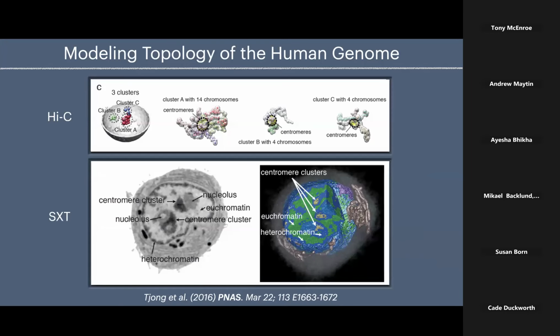with just using the LAC values. And this was a study by Frank L. He had collected all of the Hi-C data of a bunch of B cells that had been done by one study, and was modeling how those chromosomes would have to pack to fit inside of a nucleus.